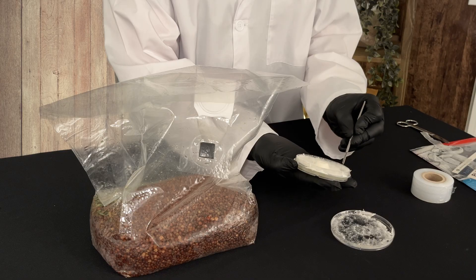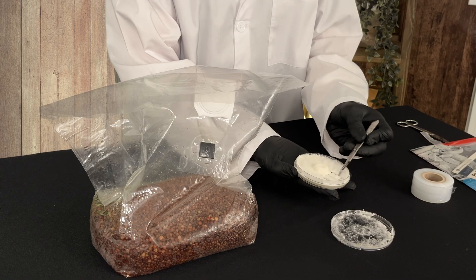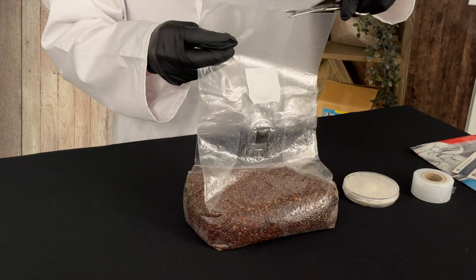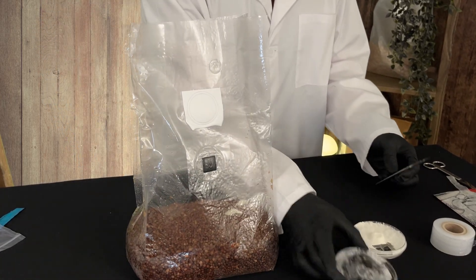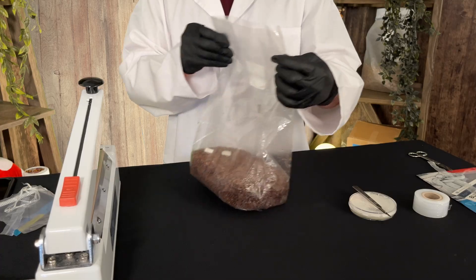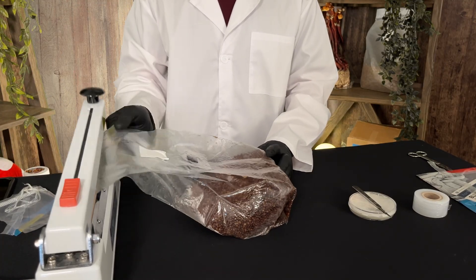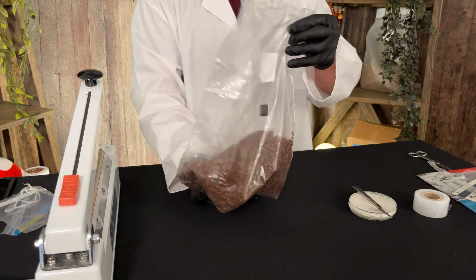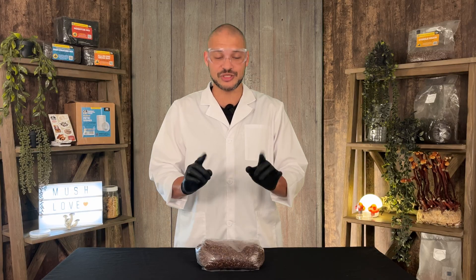Cut a small wedge of mycelium from the agar plate — just enough to introduce into the grain bag. Open the grain bag carefully to avoid exposing it to unfiltered air and drop the agar wedge directly onto the grain, avoiding the edges or surface of the bag. Seal the grain bag to prevent contamination and keep the mycelium's environment stable using a bag clip or heat sealer. Gently work the agar into the grain and set it aside. Incubate at 70 to 75°F for one to two weeks — the mycelium will begin colonizing the grain just as with liquid culture.